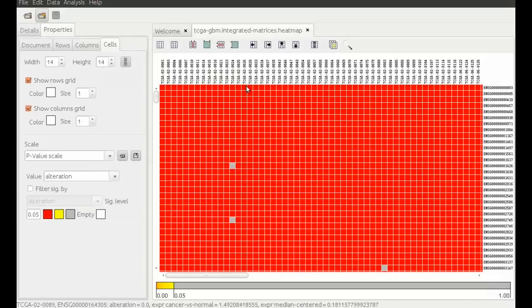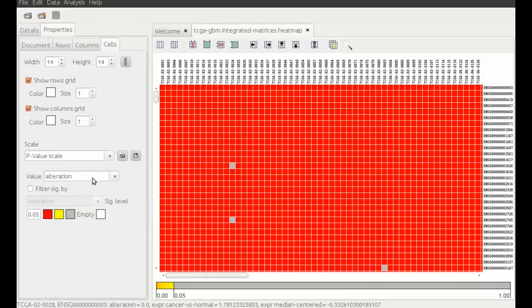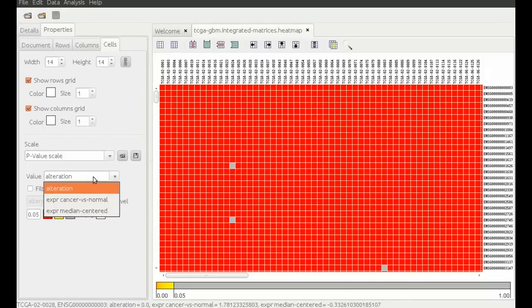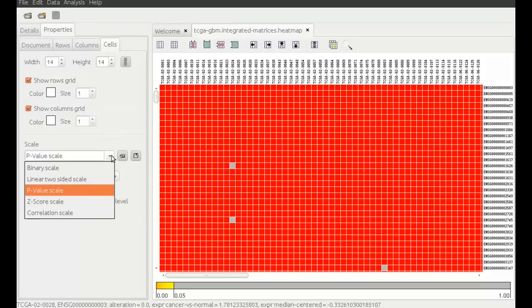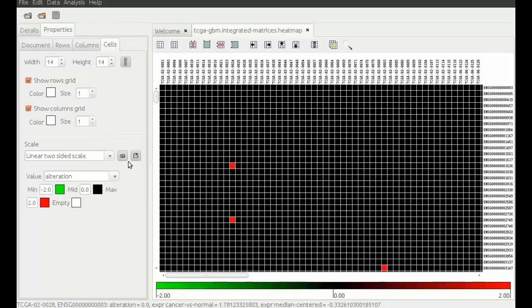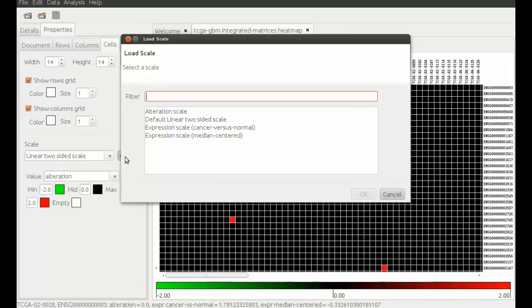In the properties panel to the left, you can adjust which value dimension you want to visualize. In this multidimensional matrix, we have alteration and two different expression values per patient and gene.